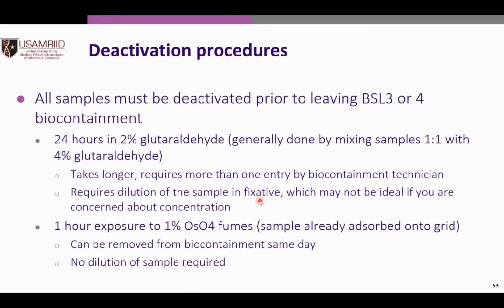We do have a different protocol for tissue, and it's been a while since I did tissue, so I'd have to double check, but I think that one is 2% glutaraldehyde, and I think they have to stay in it for a week if I'm not mistaken. I'd have to review that if anybody wants that information. These are proven methods that we know the virus can no longer infect anything. It is dead, but we are trying our best to protect the morphology on the EM side. So these are the two protocols we use at USAMRIID.